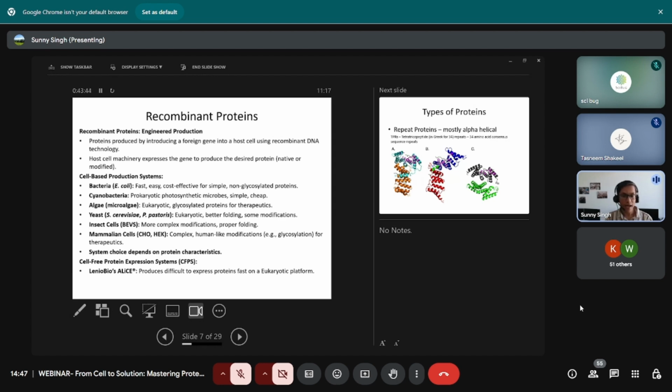And that's how we get a lysate, a yellow colored lysate, which you will see in the pictures later, to which we add DNA of our choice for the protein that we want to make. And we are able to make protein in just 1 to 2 days. So that is a really fast system, and that was one of the reasons why I wanted to know how we do it. That's why I joined this company.